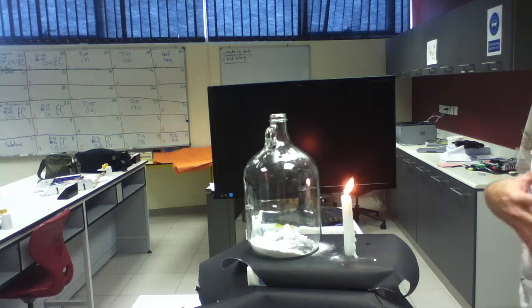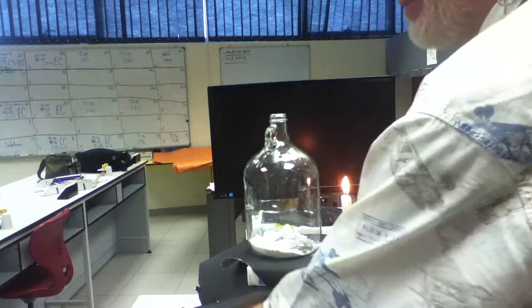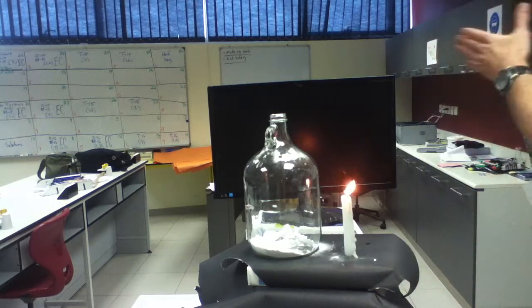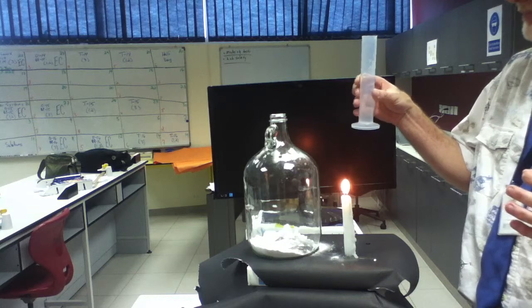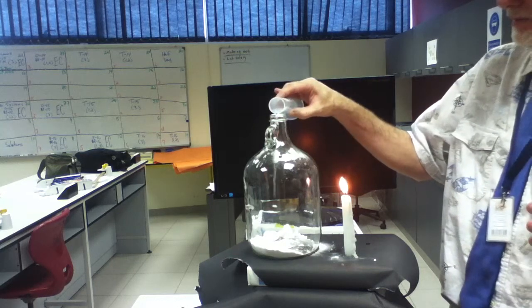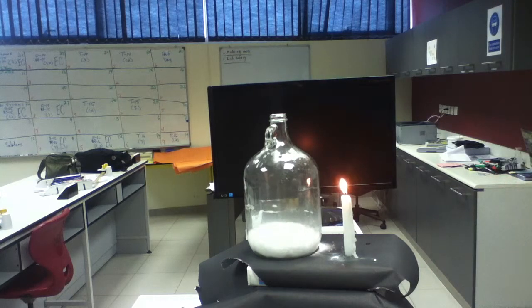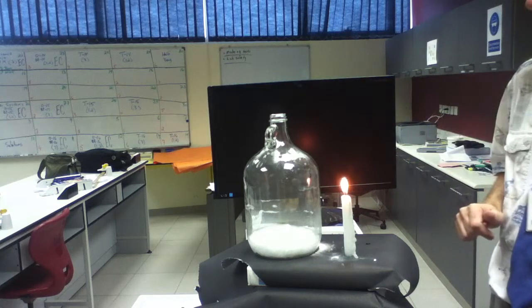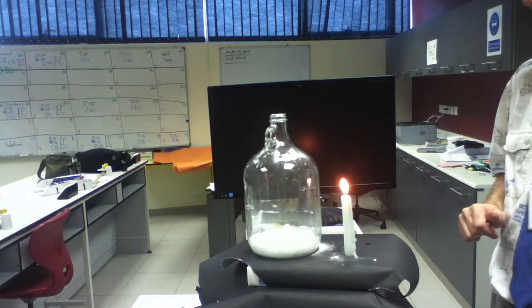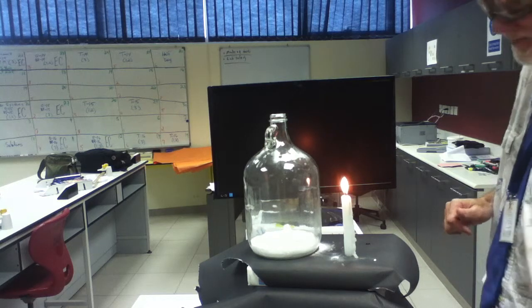You know what it feels like when you get acid indigestion? Well, I don't want acid indigestion on my face. The front row here has goggles, right? So I'm going to do the reaction. You okay with that? You ready? A bit more vigorous. You see that? Now you can see the carbon dioxide coming out of the top. Did you see that? Did you see it? It may have gotten it on tape.